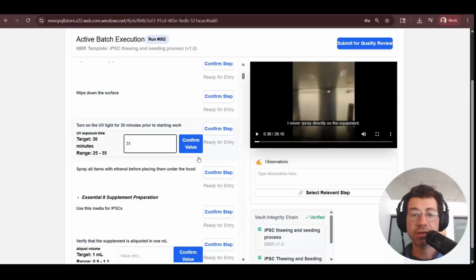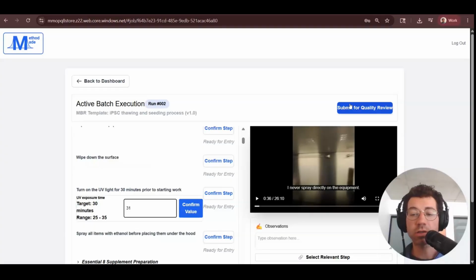Once they are finished with the batch record, they submit it for quality review. And it has now completely disappeared from their world forever. This operator is never going to know the outcome of this batch. It's actually none of their business. All they're supposed to do is execute and submit. Now let's take a look at the actual completed batch record.